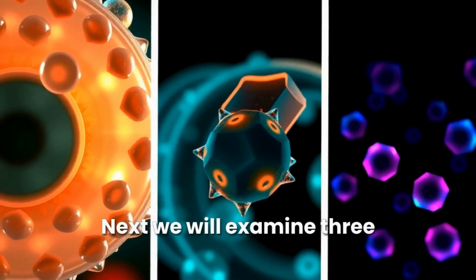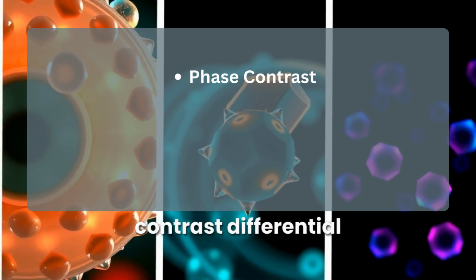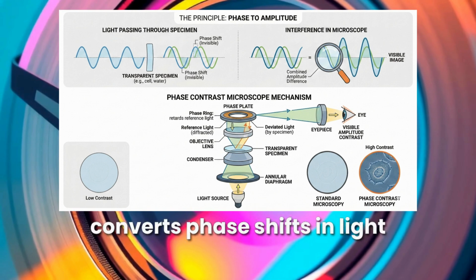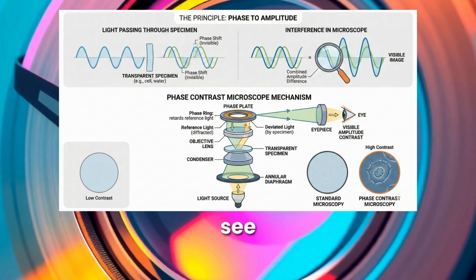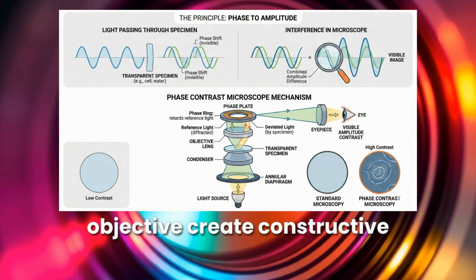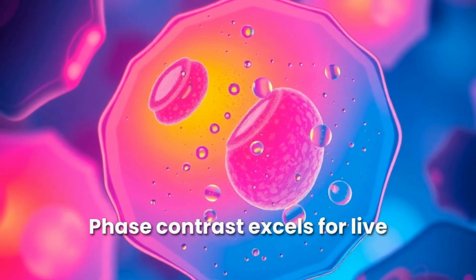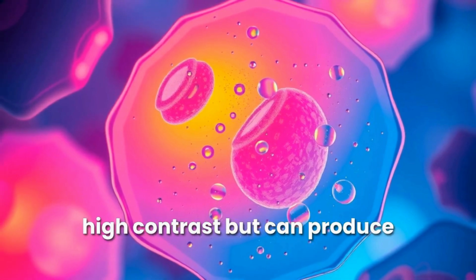Next, we will examine three widely used approaches: phase contrast, differential interference contrast, and fluorescence microscopy. Phase contrast microscopy converts phase shifts in light passing through transparent specimens into amplitude differences that the eye can see. An annular diaphragm and a matching phase ring in the objective create constructive and destructive interference, outlining cell edges and internal structures.